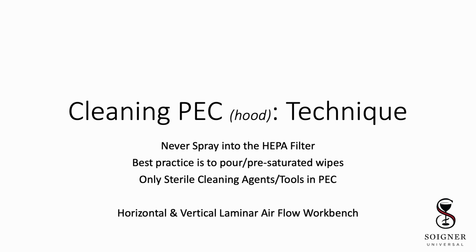Also, remember that only sterile cleaning agents and wipers are allowed inside the PEC. If you have any tools that must be used to assist in cleaning the interior of the PEC, those tools must be clean and disinfected prior to use.